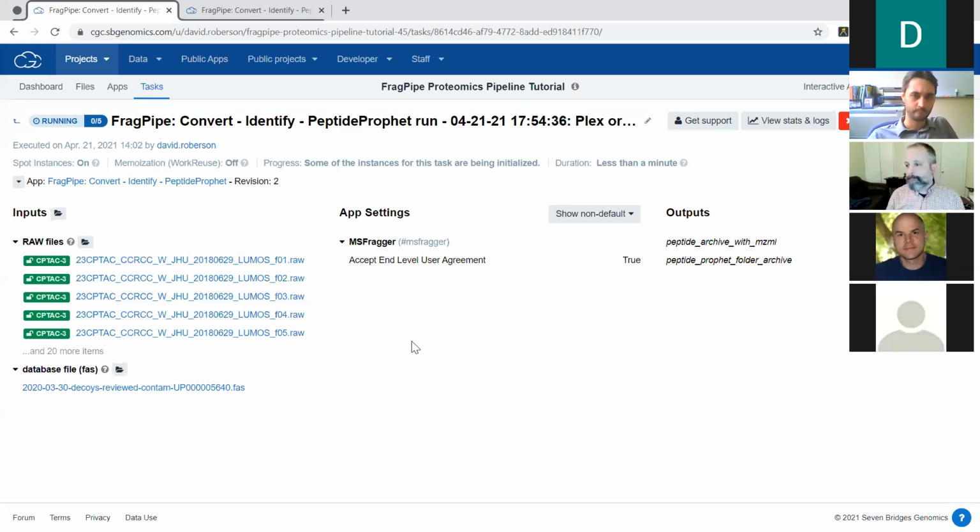Hey, Dave. It's Paul Rudnick. I just had a quick question for you. You mentioned a huge number of parameters. Did you launch the task with a default set of parameters, or is there a parameter file that's linked in the background, or how are the parameters set? Great question. This is all built into the CWL description. Felipe painstakingly went and typed in options for each of the parameters.